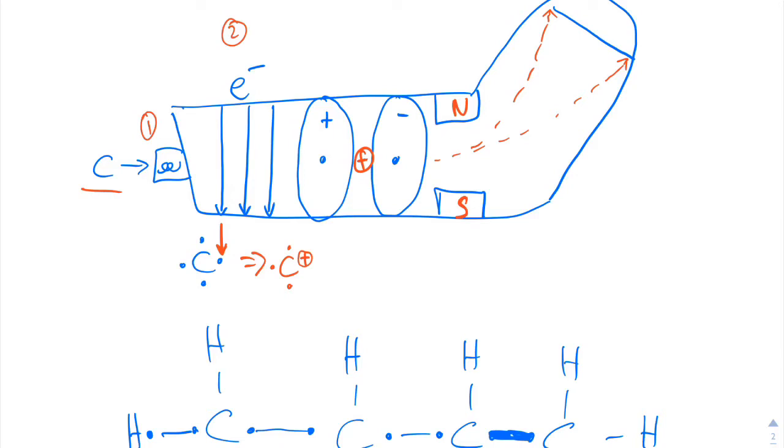One of those electrons, traveling like a waterfall, smashes into our carbon atom and knocks off an electron. Just like in a bowling alley, you throw a bowling ball, it hits those pins and knocks them everywhere. So our carbon is now missing an electron and it's got a positive charge. This was very important because it allows step 3 to occur.